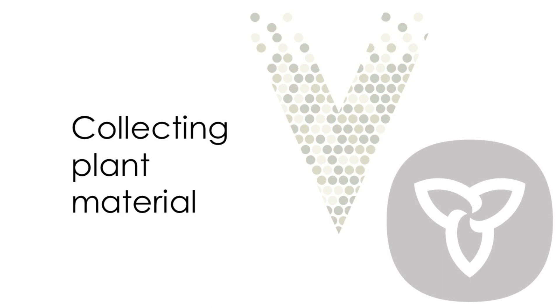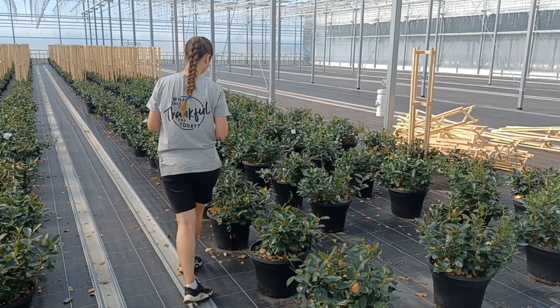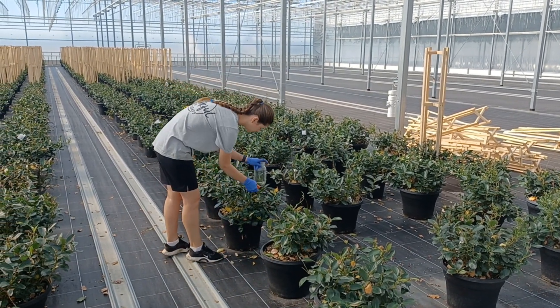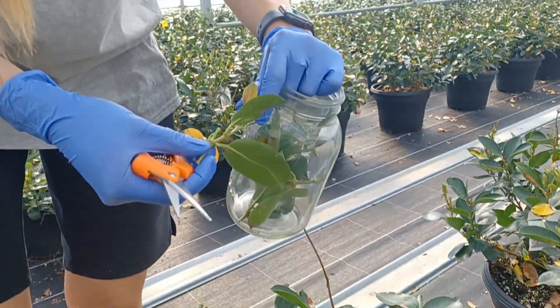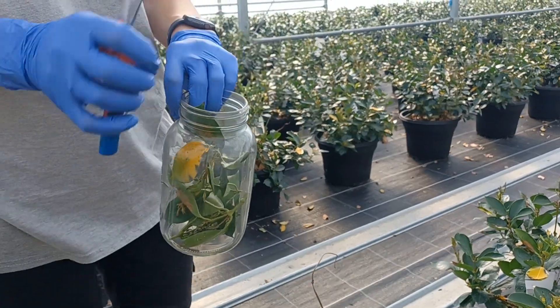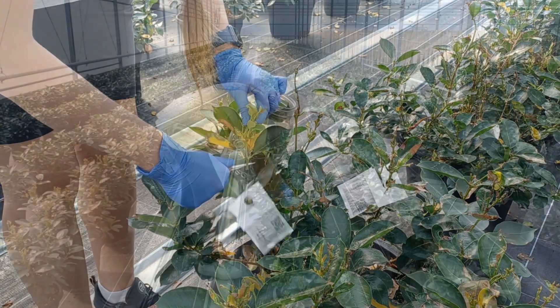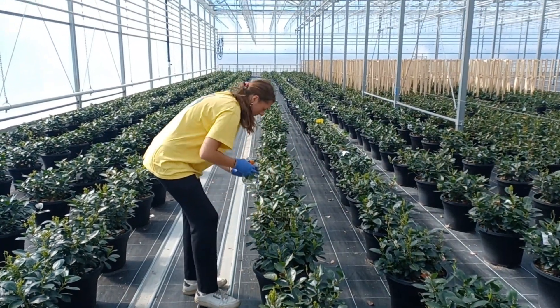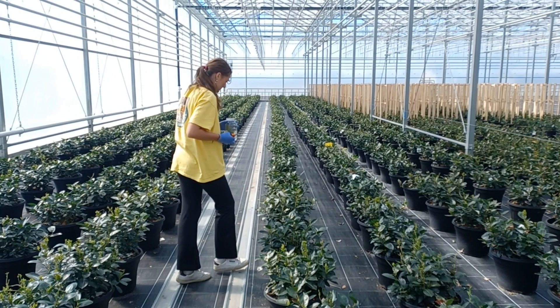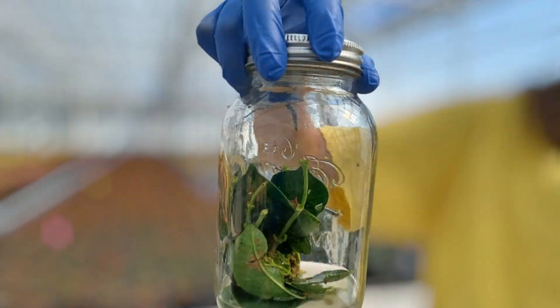The first thing you'll want to do is collect plant material that you want to wash. Generally thrips and other pests prefer new growth, so that is where you're most likely to find adults and immature stages. You'll need to cut growing points or flowers off of the plants and place them in the washing jar. Make sure you collect a representative sample of plant material throughout the crop or variety you are interested in. Do not pack the cuttings too tightly in the jar as you want to be able to effectively agitate them in the wash solution.